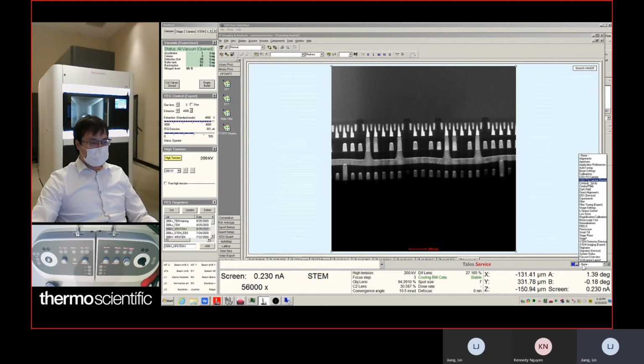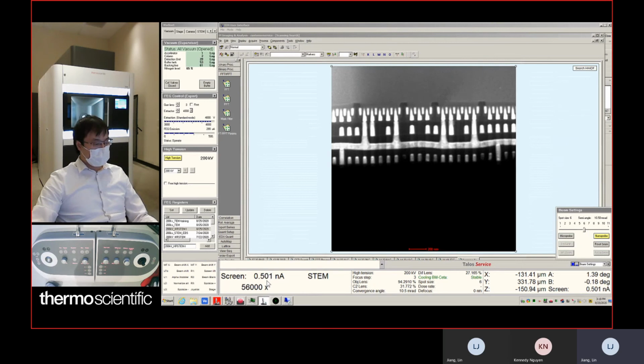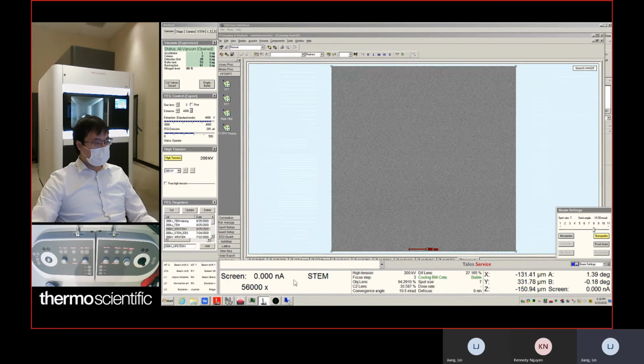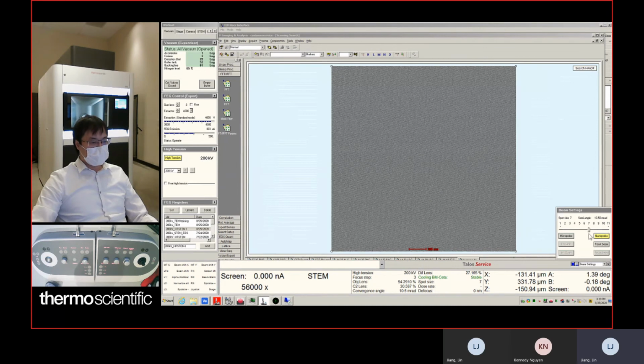And then you can also choose different spot size. So remember, we can select the sub window and select the beam setting here. Then you can just click and select any spot size. You can decrease it to further increase the current, and right now you get almost 0.5 nanoamp current. Also, you can increase the spot size to 8 to decrease the beam current. So it's your choice. It pretty much depends on your imaging application, whether your sample is beam sensitive or not, and how much contrast you want to get from imaging. And for this training, I just choose the spot size 7.